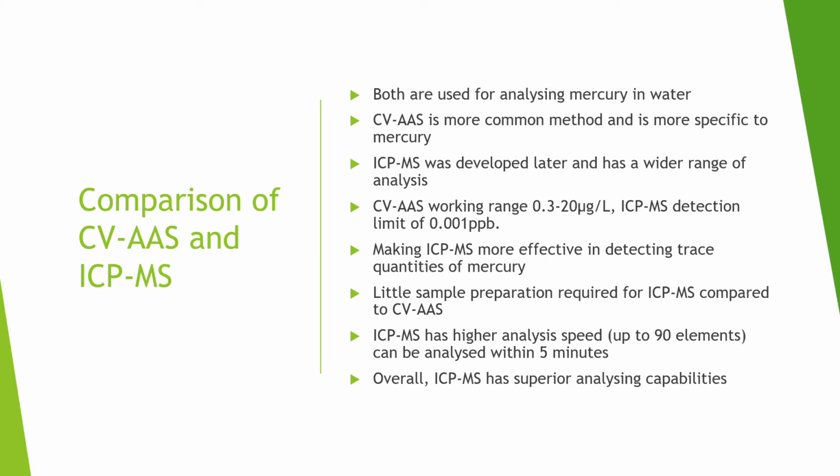There is also little sample preparation required for ICP-MS compared to CVAAS, but the ICP-MS has a higher analysis speed. Up to 90 elements can be analyzed within 5 minutes. Overall, the technological advancements between the CVAAS and the ICP-MS has provided the ICP-MS with superior analyzing capability.